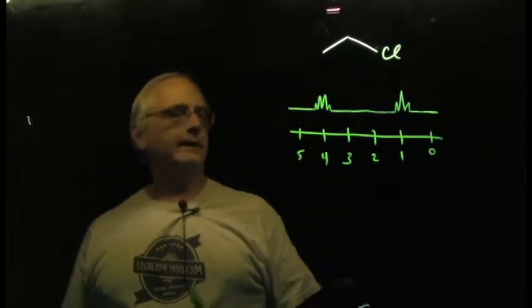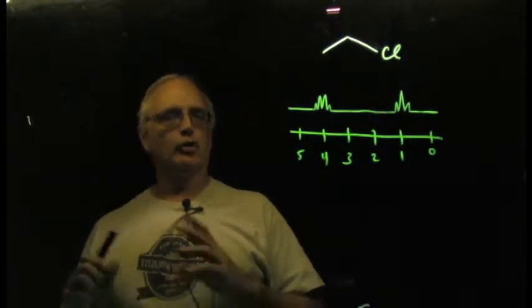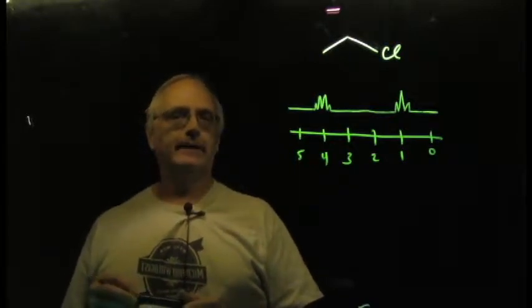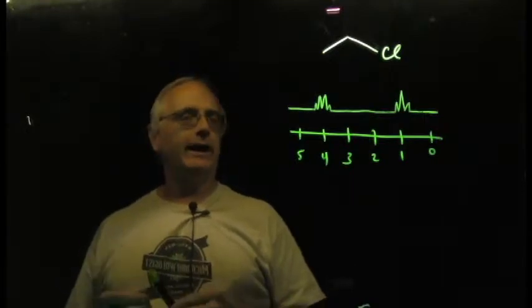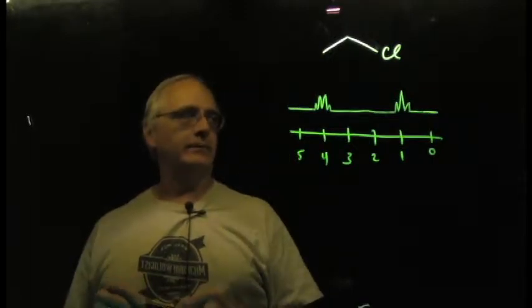All right, back down on the glass again, because I want to talk about one other really critical aspect in our early work in interpreting NMR spectra, and that is integrated proton spectra. This is the stuff that tells us how many hydrogens are in each group that we see in an NMR spectrum.